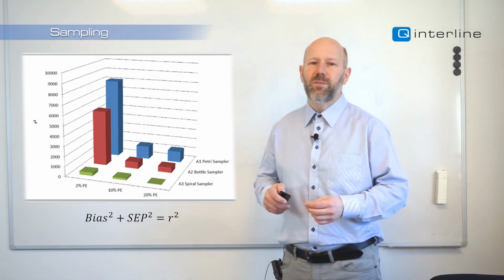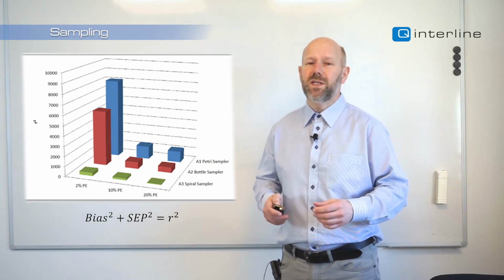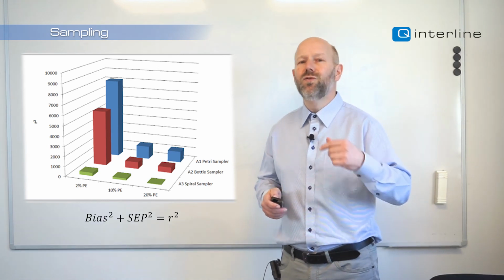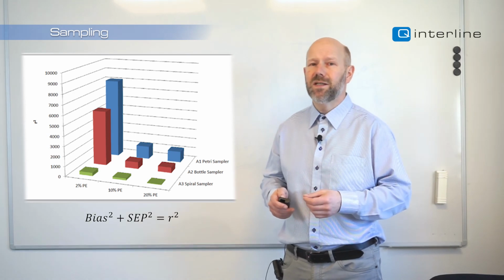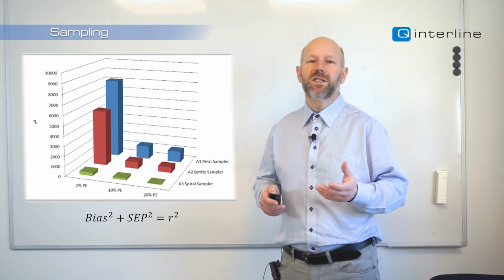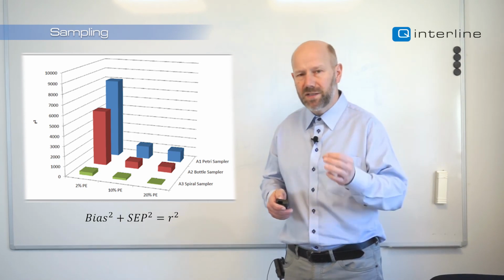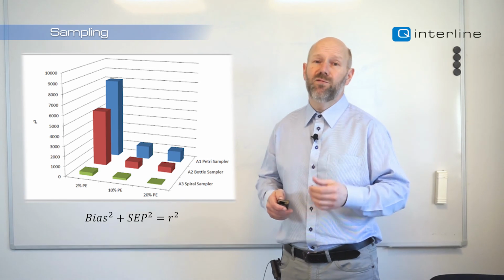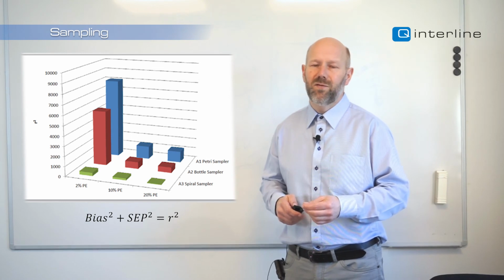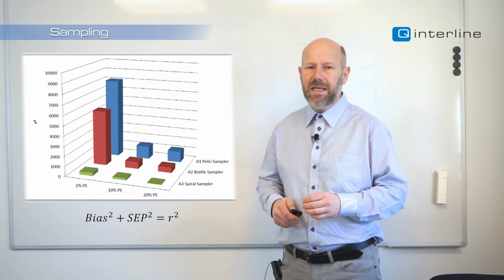But we also see that by doing real composite sampling, like what's done in the spiral sampler, we see a huge area, so we will simply catch much better the 2%, the 10%, and the 20%, but it's also more difficult to repeat because it simply sees something new every time. But in total, seeing a large, composite sampled area is the way forward and will give by far the best results, as can be seen with the green results here. So these are some of the sampling things to consider when you present a sample to an analyzer.